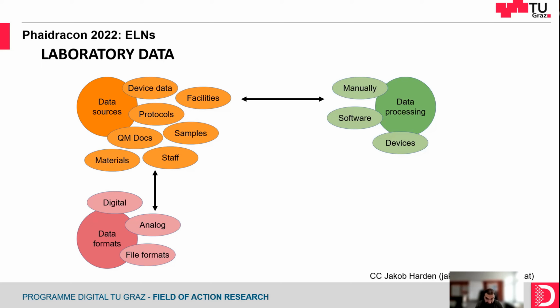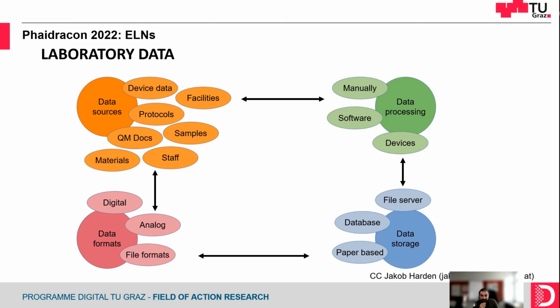Then we have the data processing. So how did the analysis go? Did you do it by hand? Did you do it manually? Did you use the specific software, or did you write the code by yourself? So plenty of options here. Also the devices, and of course somewhere this data has to be stored.